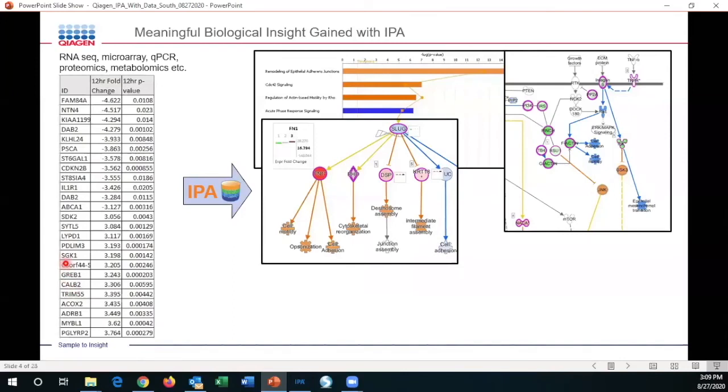Then, just like with pathways, we're going to ask a follow-up question. If we deem a regulator important in our expression programming in our system, then we're going to look at the pattern of expression in our data set, and again utilize that relative to a pattern we derive from the literature to try to predict whether those regulatory molecules are activated or inhibited. In this context, when we think about these regulatory molecules, obviously these would be targets for therapeutic intervention, perhaps. These would be biomarkers, right? These could be a number of things, but these are the key molecules facilitating the change in our system.